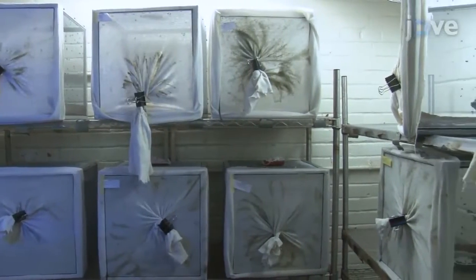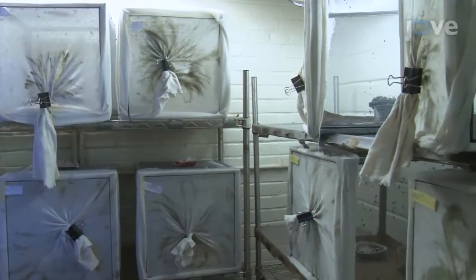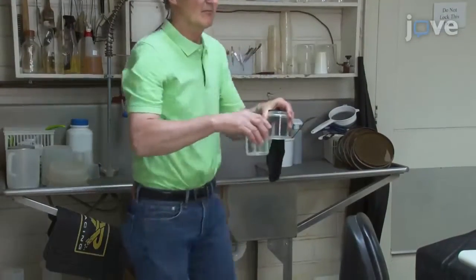The medium is composed of only 4 ingredients. Propagating Stomoxys calcitrans begins with collecting eggs from a stock of flies. This involves preparing an egging cup.